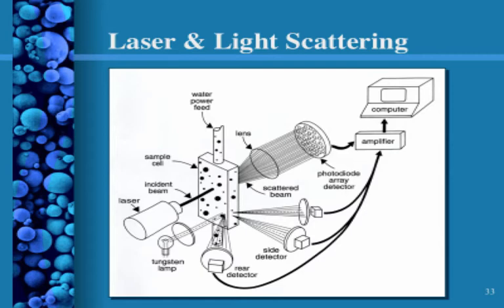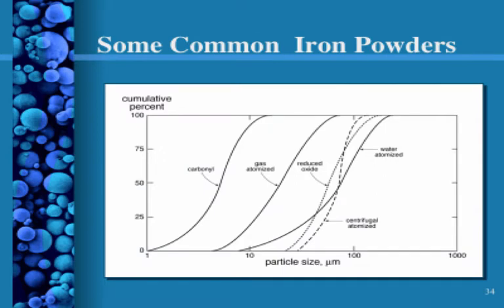That's going to block off a lot more light. So for irregular shaped particles, you will need to measure from different sides and correlate that information of light intensity change with particle size distribution. And of course, if you change the wavelength of the light, you can measure scattering for different particle sizes.